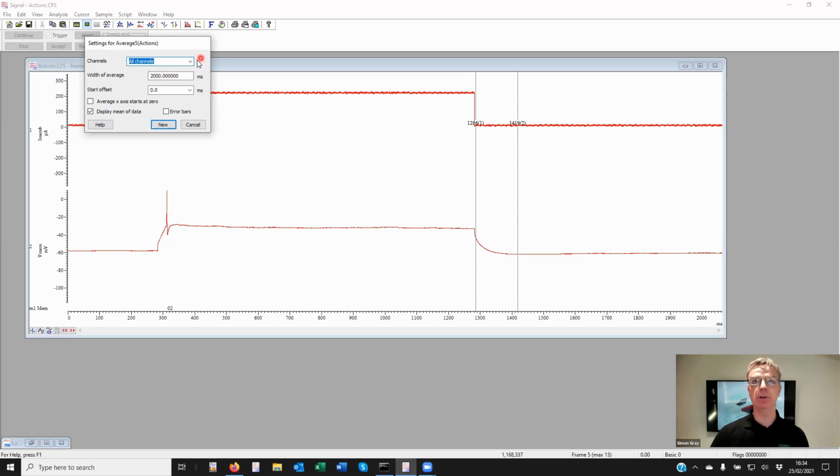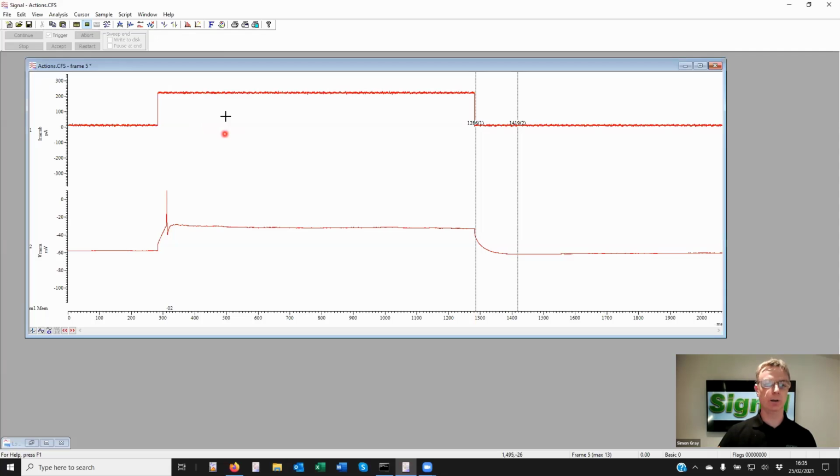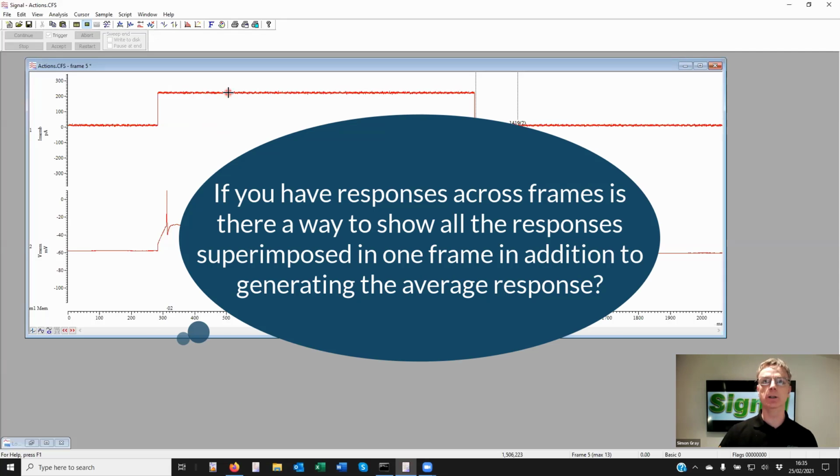And when it builds the average, it becomes real data that can be manipulated. Even then, it's not going to line up with the same channel in a different file. So a little bit more care is needed there. If that's something you want to do, then by all means, get in touch with me, and I'll get back to you in more detail.